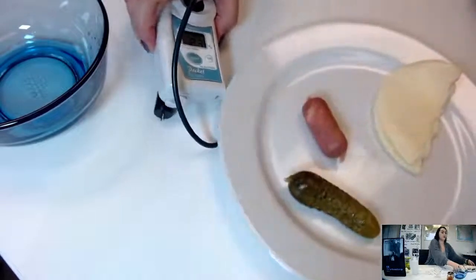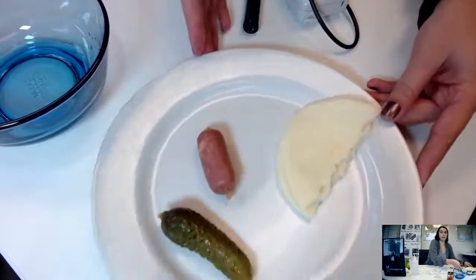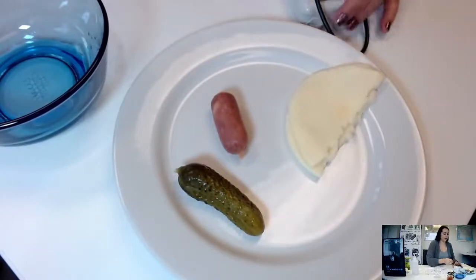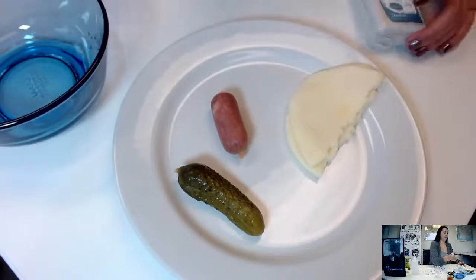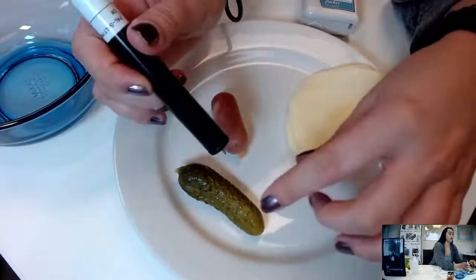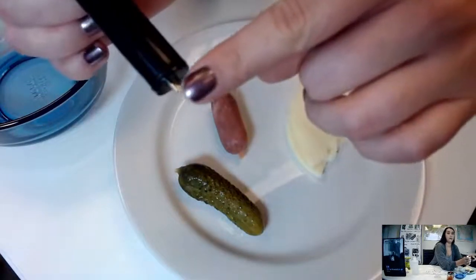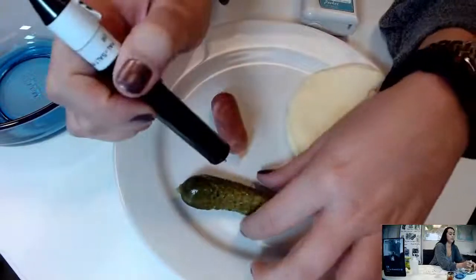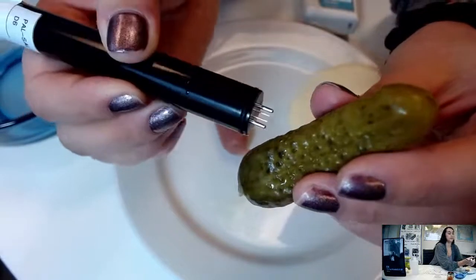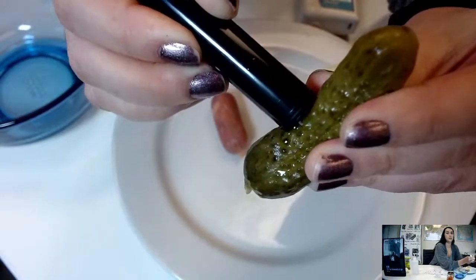Here are these samples that I have today to use with this tool. All right, so for solid objects, you're gonna want to gently just insert the metal pieces right here, the electrodes, into the sample. So you're just gonna take it like this and just gently insert into the sample, just like that.